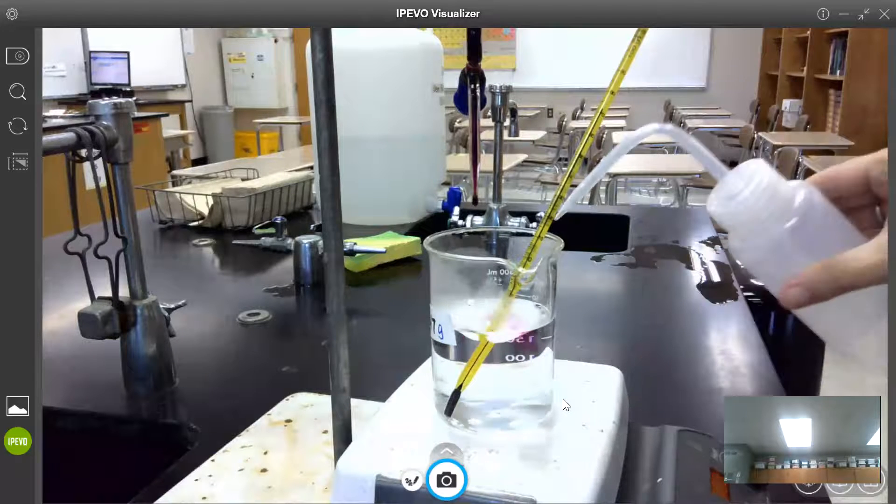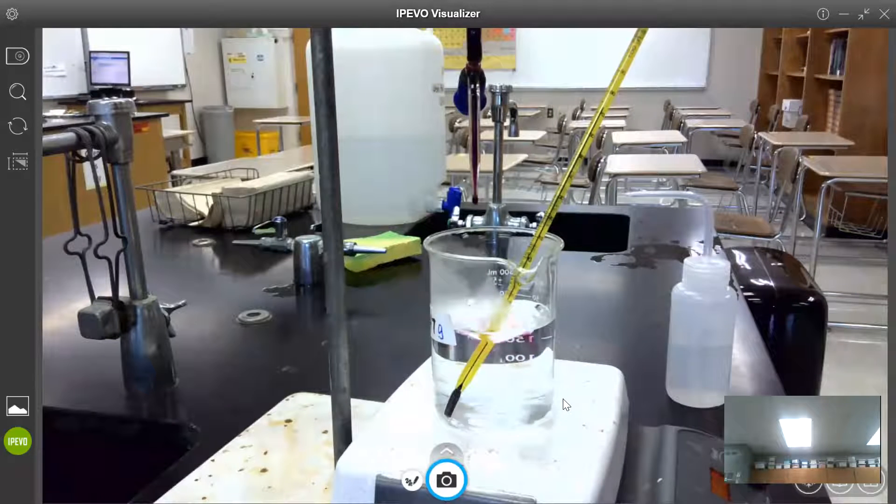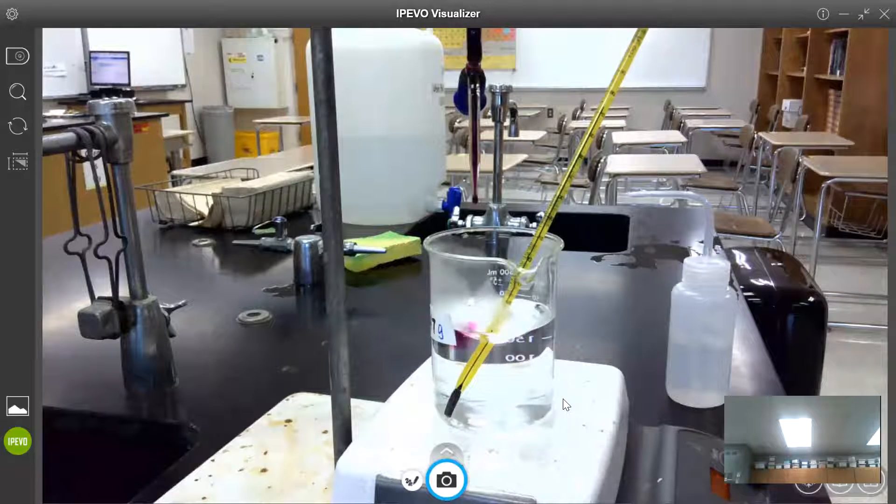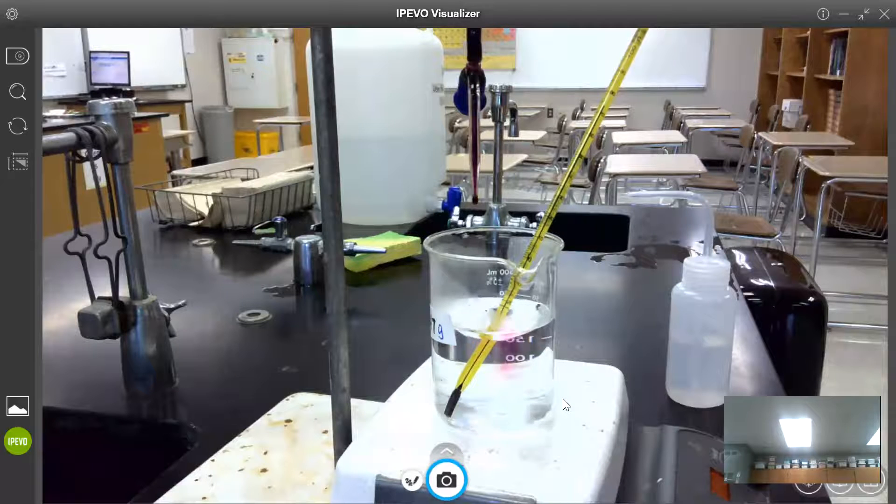is that after adding the KMnO4 we see that pink color persist. In other words it doesn't dissipate when it reacts. That will tell us that the KMnO4 has reacted with all the sodium oxalate that's in the beaker.